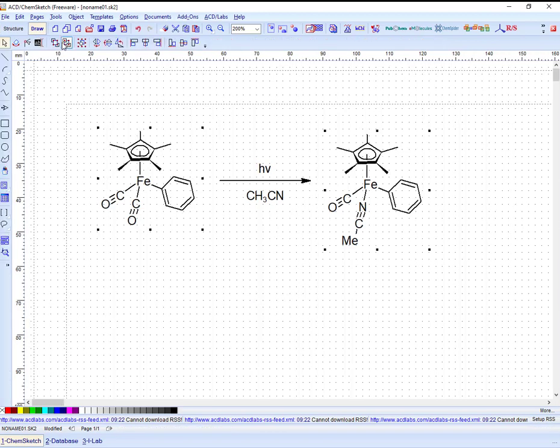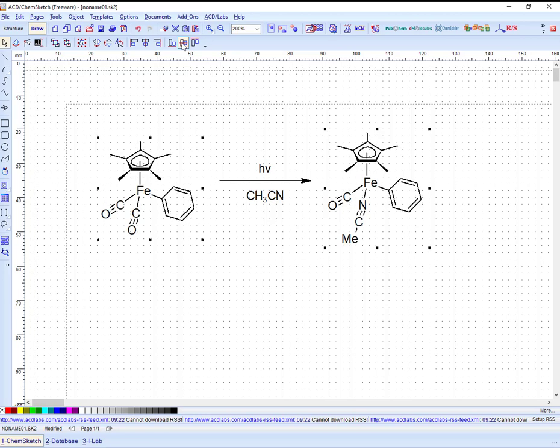Or what I could do, I can go to the Draw feature, I can center them, and I want to center them vertically. So if I click on this, it's going to shift them so that it's centered. Okay, and if I look at everything else, everything else seems to be pretty reasonable. But again, you can highlight things and move things around so that things look nice.